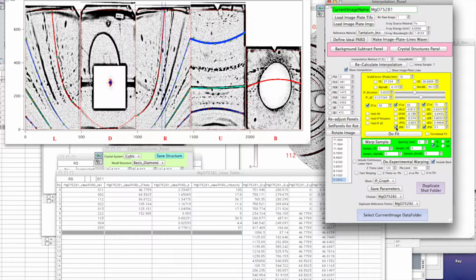Those only if you have. So those two here are for this panel. So if you didn't put any dots in here, there won't be any constraint for this panel. So you should leave them like this. I don't think I did put any dots. Yeah, so you should leave them fixed, otherwise. I'll leave them fixed. Yeah. Okay. Or you put some dots on this line and you try to fit them. Oh, okay.